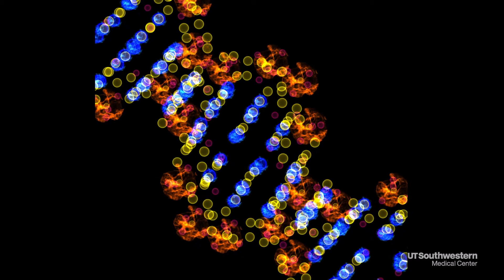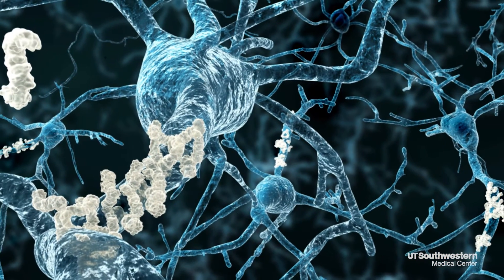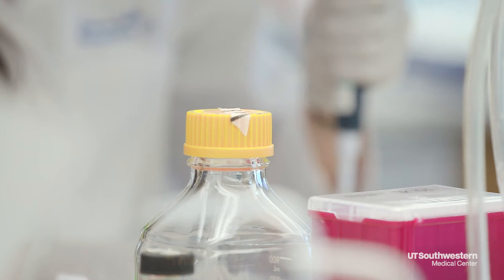By subjecting proteins to X-rays we can see their structure. By subjecting it to the electric field we can stimulate the motions, and by putting the two things together we get to stimulate motions in proteins and watch the protein move with atomic resolution.